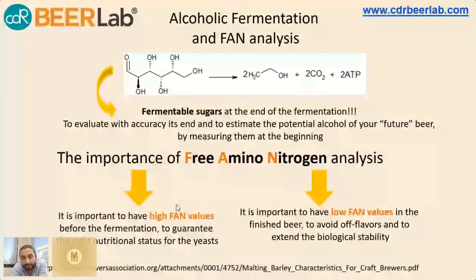At the same time, in your finished beer, it's very important to have a very low value, as low as possible, of this free amino nitrogen, because, of course, the free amino nitrogen in your finished beer could introduce off flavors.